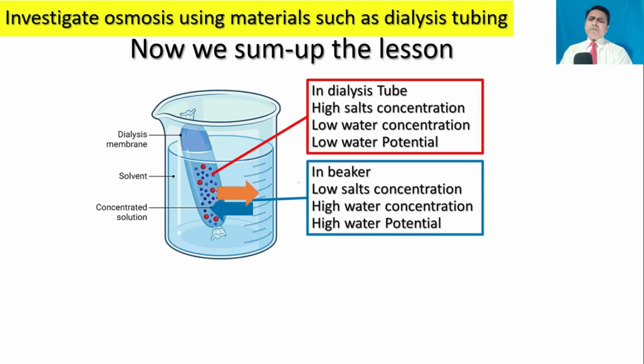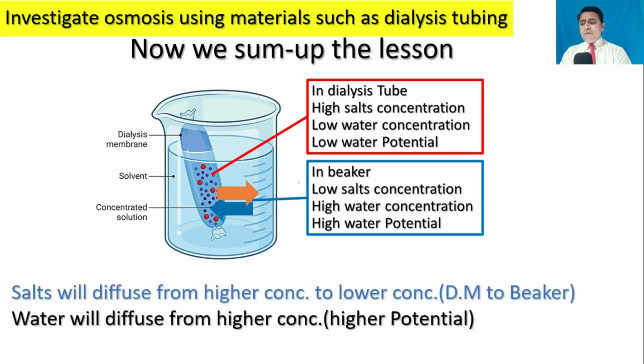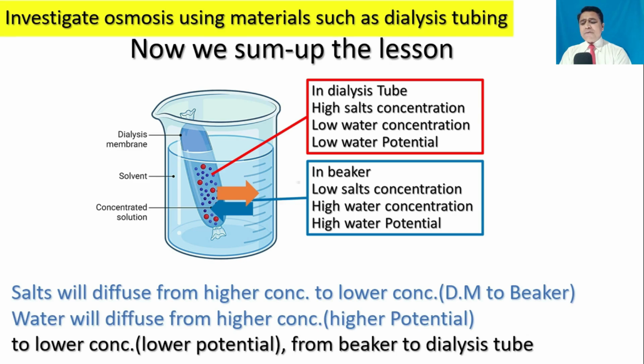Now we sum up the lesson. Salts will diffuse from higher concentration to lower concentration, from the dialysis membrane to the beaker. Water will diffuse from higher concentration to lower concentration, from the beaker to the dialysis tube. This is the summary of the lesson.